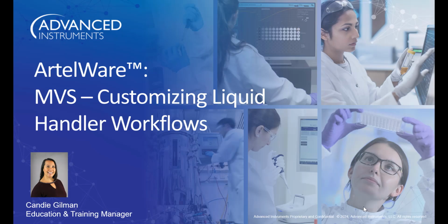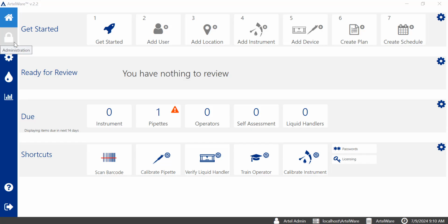Thank you for joining me for this short video focused on customizing liquid handler workflows for use with the MVS with the ArtelWare application. I've got some tidbits of information I'd like to share with you, so let's go ahead and get started. All of the settings that are customizable for your automated liquid handler workflows are contained in the Administration section of the ArtelWare application.